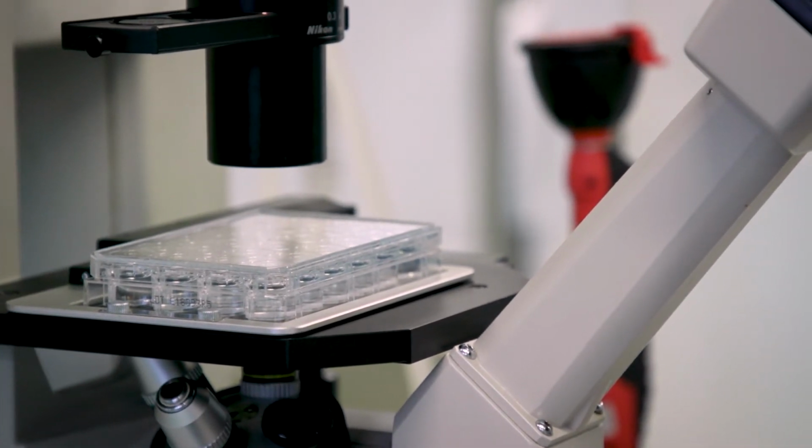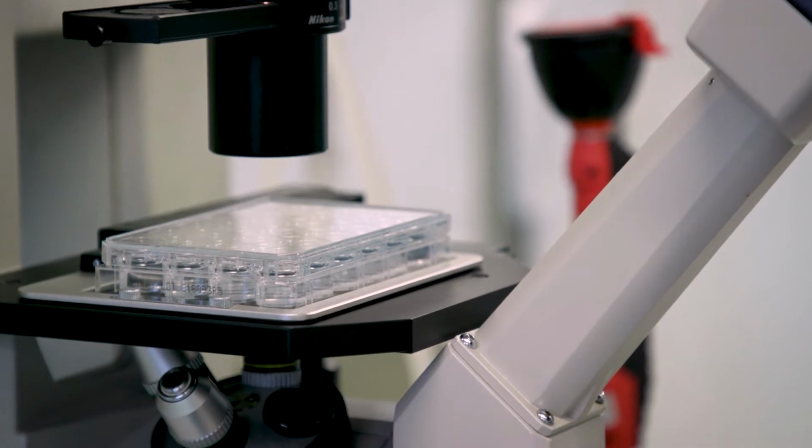And so we trained these laboratories, there were 5, and then they tested 6 chemicals, and then we compiled all the data and compared them. And what we could see there is that not only could they all do the test and establish and work with the cells, but also the variability within their laboratories and also between all our laboratories was actually very well in line with other such tests.